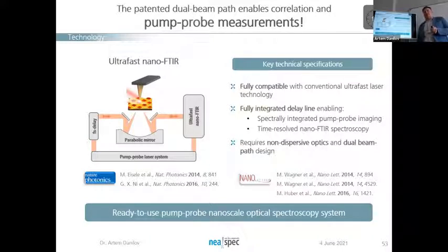I don't know. Different near-field microscopes detect different field components. As I discussed, it's not completely true that it's exactly the electric field or its component. I would leave this for interpretation to Vali Volkov because he's a good scientist. Okay, so to a good extent, it's the electric field component.